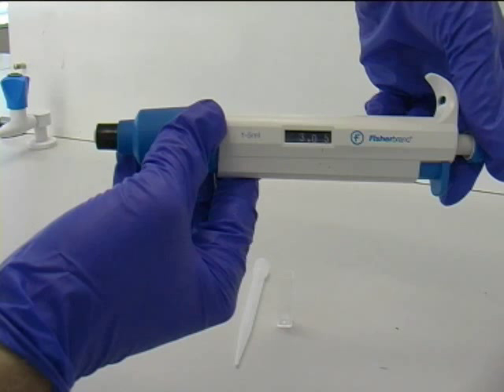The error associated with an auto pipette is half its resolution. The resolution is the minimum amount by which the set point can be changed.